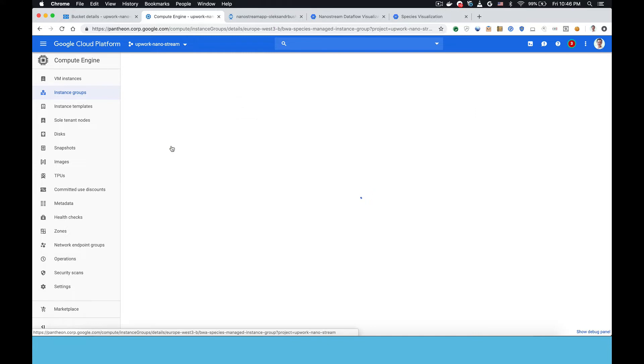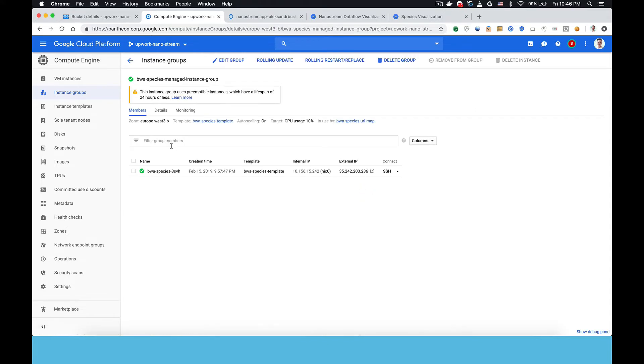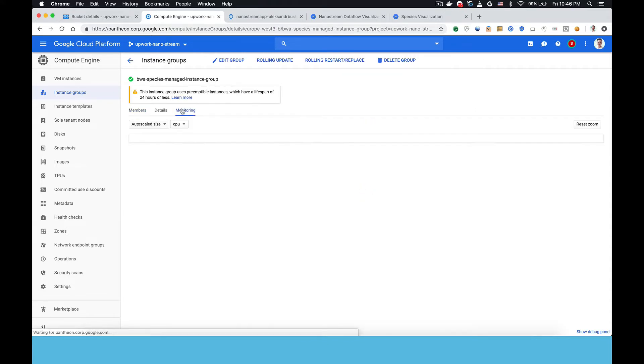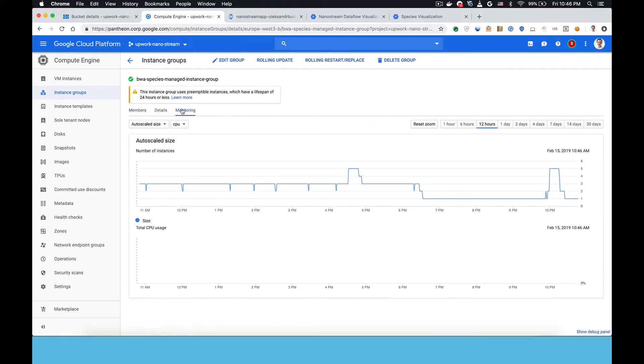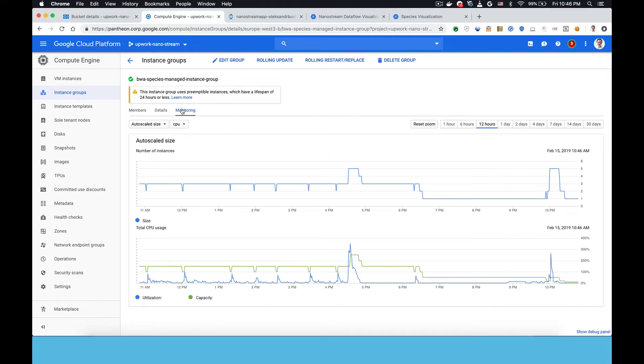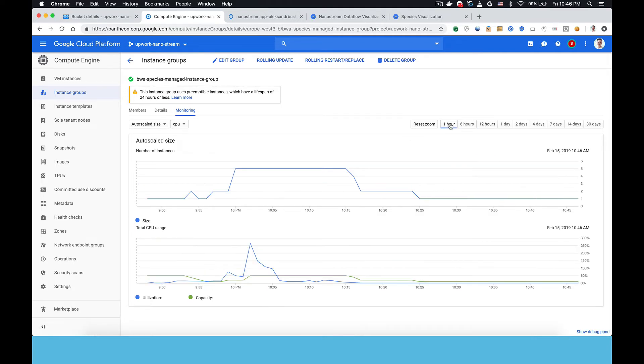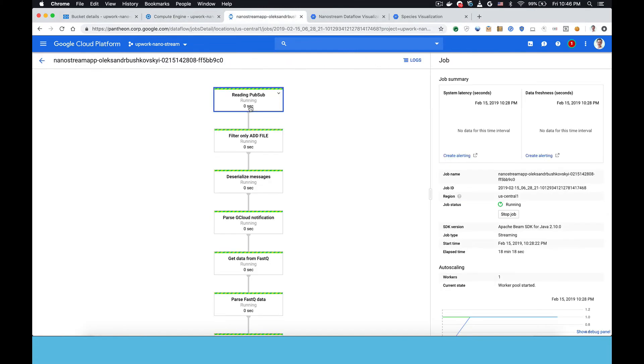Here is the aligner instance group that is actually performing the alignments. It's been running for a while but looking at the most recent one hour you can see there's a single instance running. This is what's looking up the DNA in a database to match it to a species.